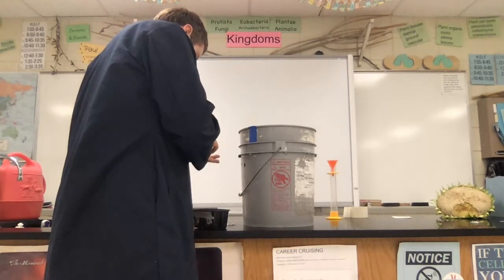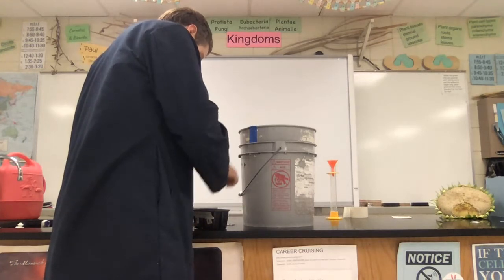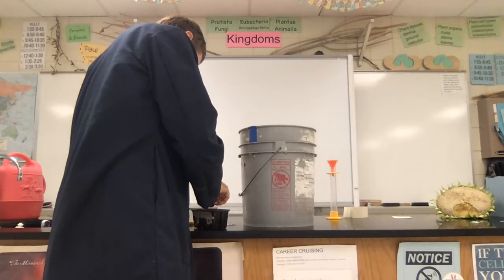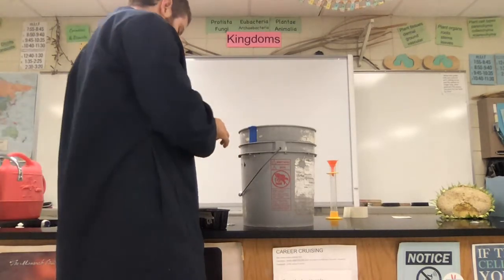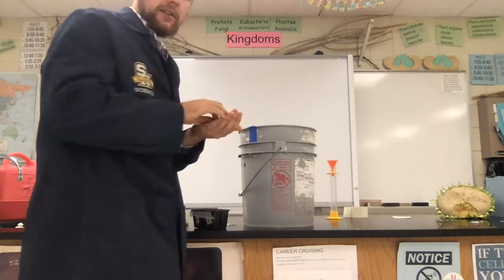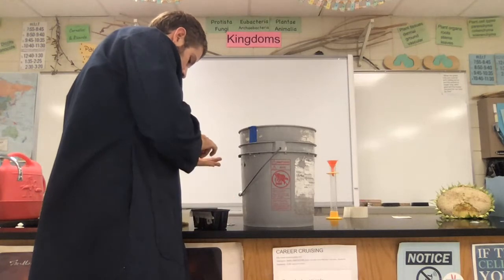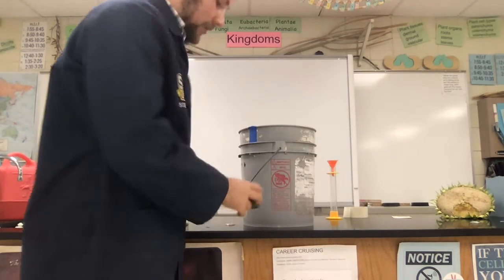One, two, three, four, and two more. And our last quadrant still needs seeds. Five, six, seven, eight. Okay, my counting got off there and I realized that.